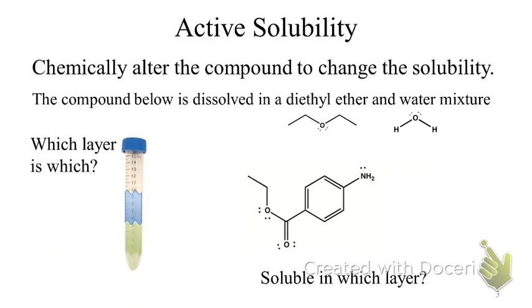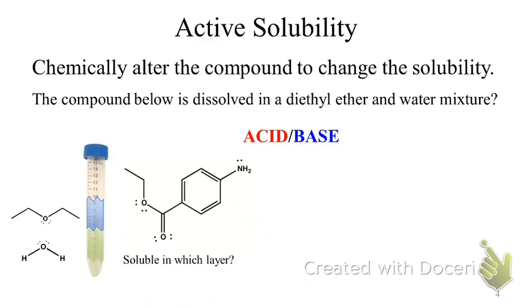And what we end up finding out, sorry, Alex, you were wrong. Diethyl ether is less dense than water, which means it stays on the surface. Okay? So we now have these two layers.